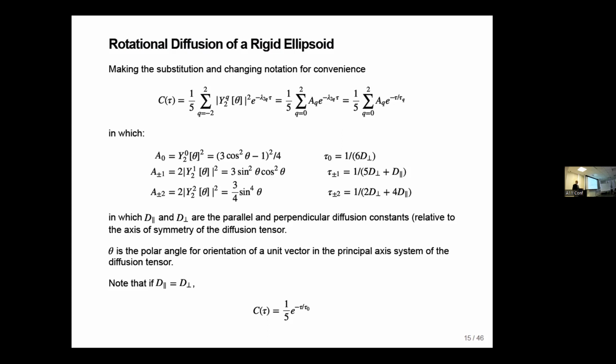In that case, you might imagine adding in another spin pair, for example, C alpha H alpha. The relaxation is rather harder to measure, but the C alpha H alpha vectors are more or less orthogonal to the axis of the helix. So they give you access to the other orientations that you need.